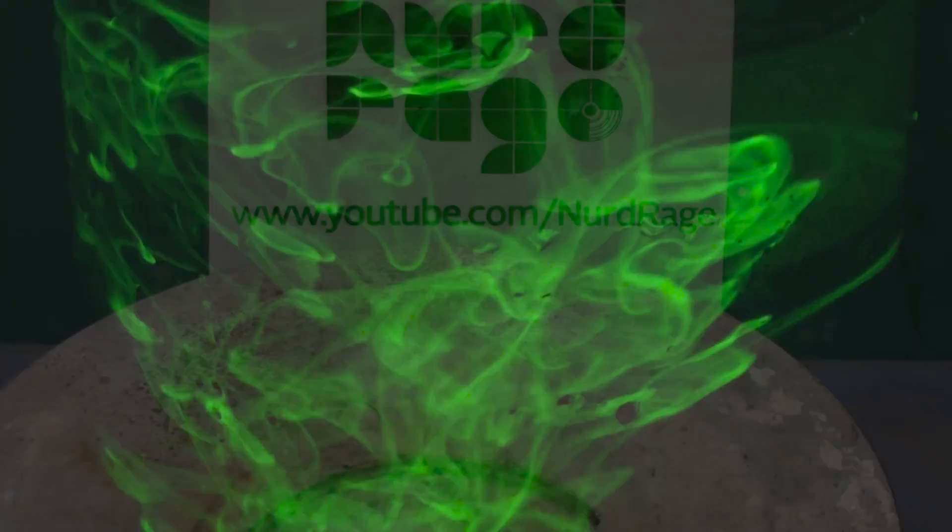Greetings fellow nerds. In this video we're going to make fluorescein, a strongly fluorescent chemical.